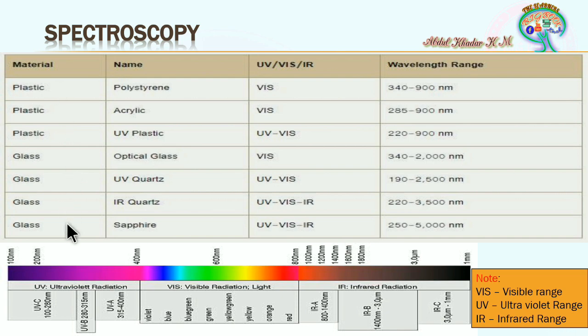Glass cuvettes are not like that. Glass cuvettes are not going to get any scratches, and also you can wipe the fingerprints very easily and keep them clean as per the guidelines given in the manual.